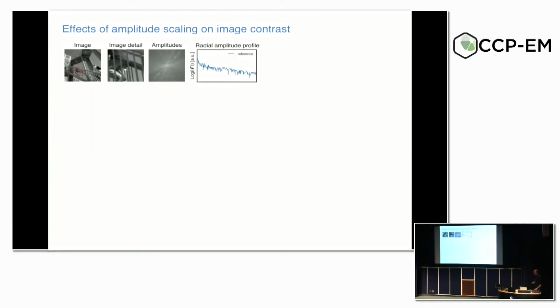That this can make sense, I'll try to illustrate with a simple 2D example. What you see here is an image over which we have laid a gradient, where the amplitudes are locally scaled differently.